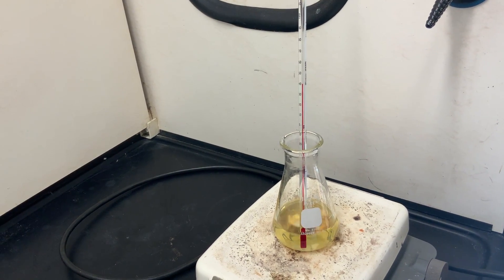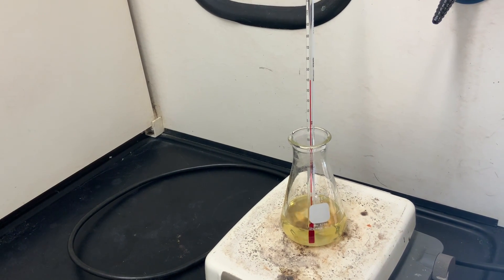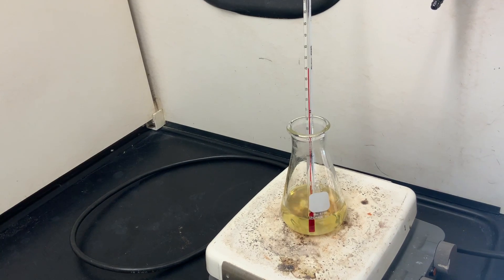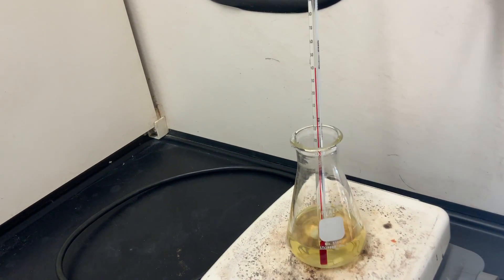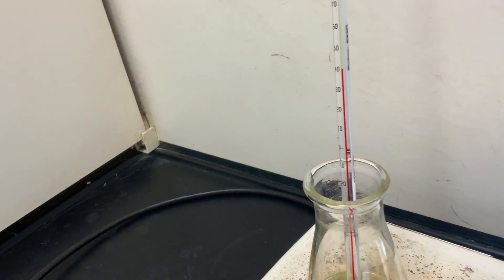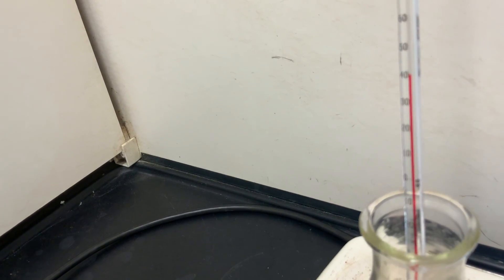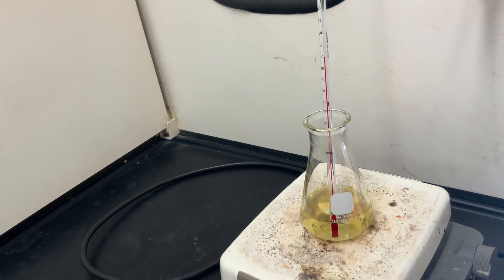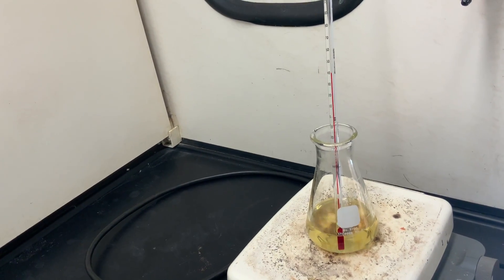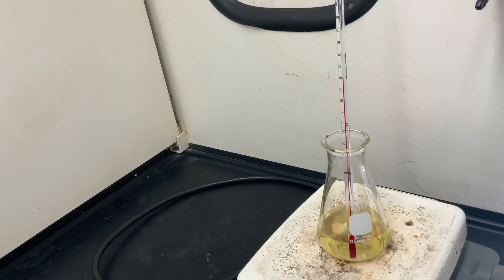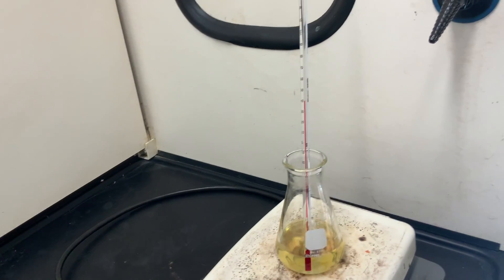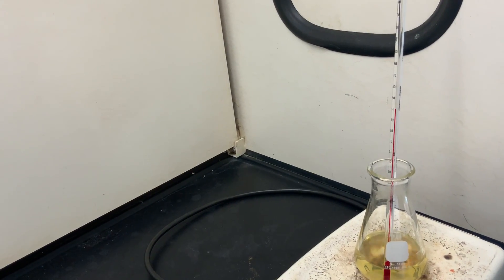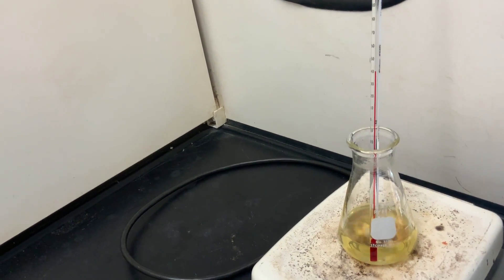Now that we have been heating our vegetable oil and sodium ethoxide mixture for about 30 minutes at about 40 degrees Celsius, we're ready to allow the mixture to separate into two layers. We'll remove the mixture from the hot plate.